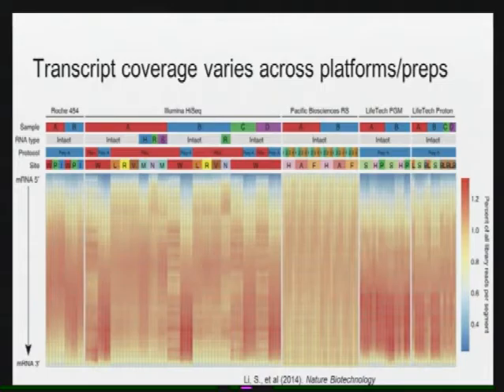Yes? Also, I was wondering if you can explain why there are so many more samples for Illumina versus Roche versus Life Technologies. It seems like Roche has more sequence that they're reading in the middle, but there are only a few, versus Illumina, where they're reading a whole bunch more things. Then you can compare whether this method is the better one, because one method could only read a few very well, but not everything, whereas Illumina can read more, some good, some bad. So how can you compare if the numbers are not the same?